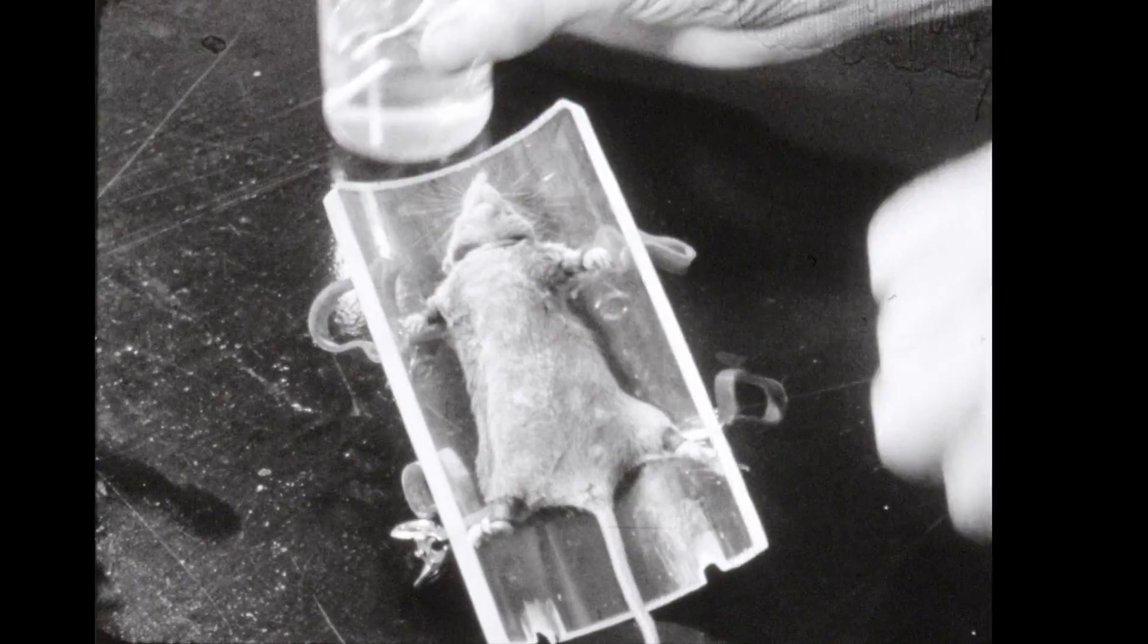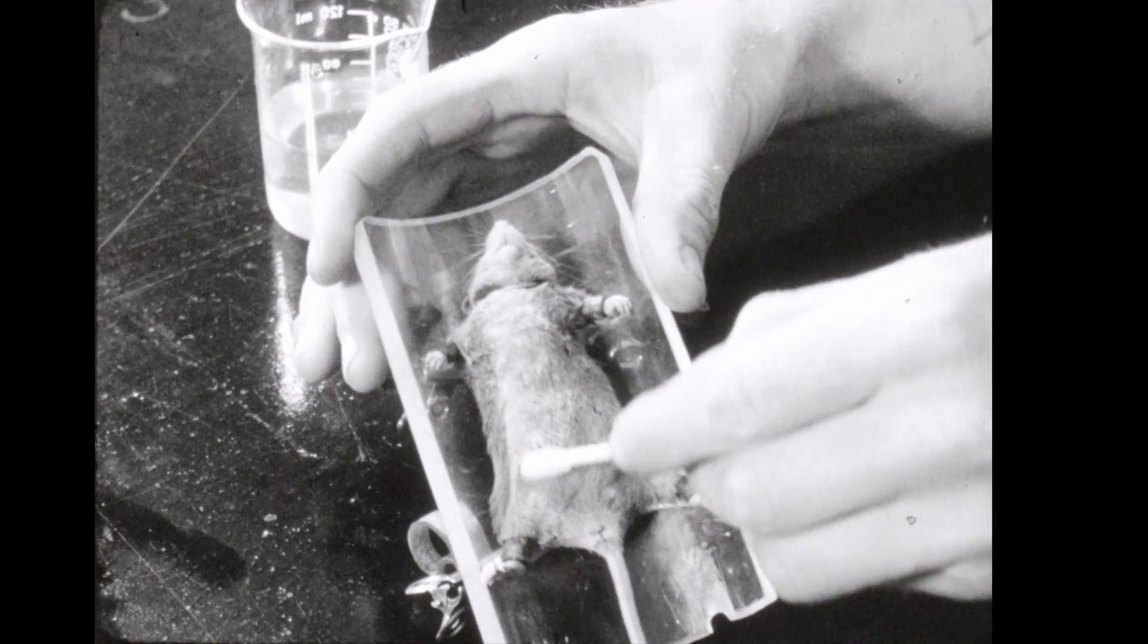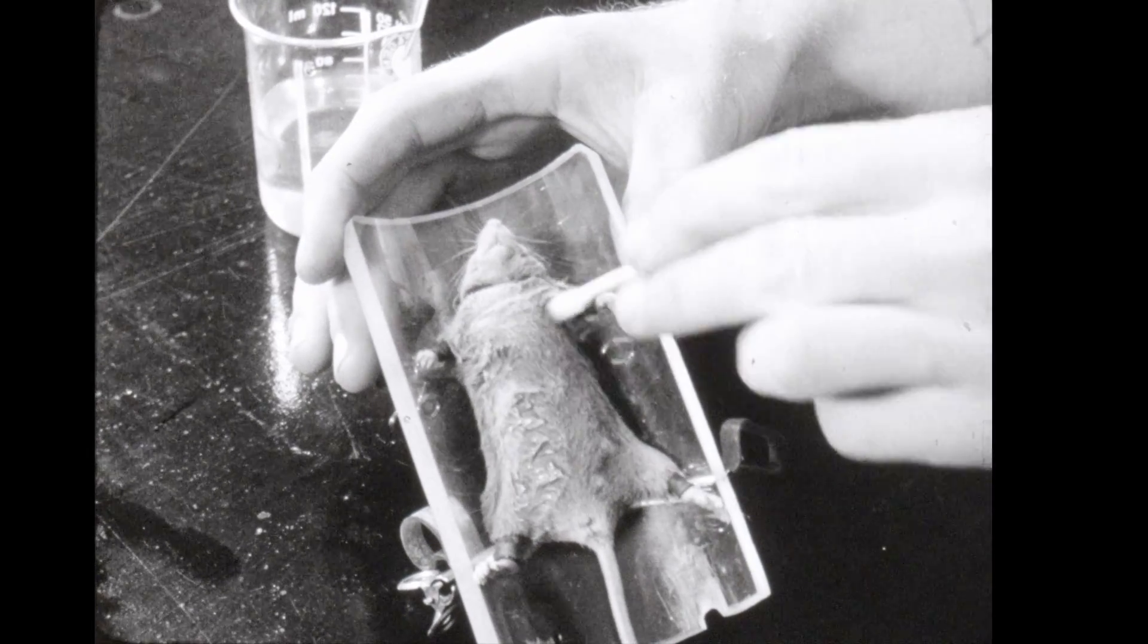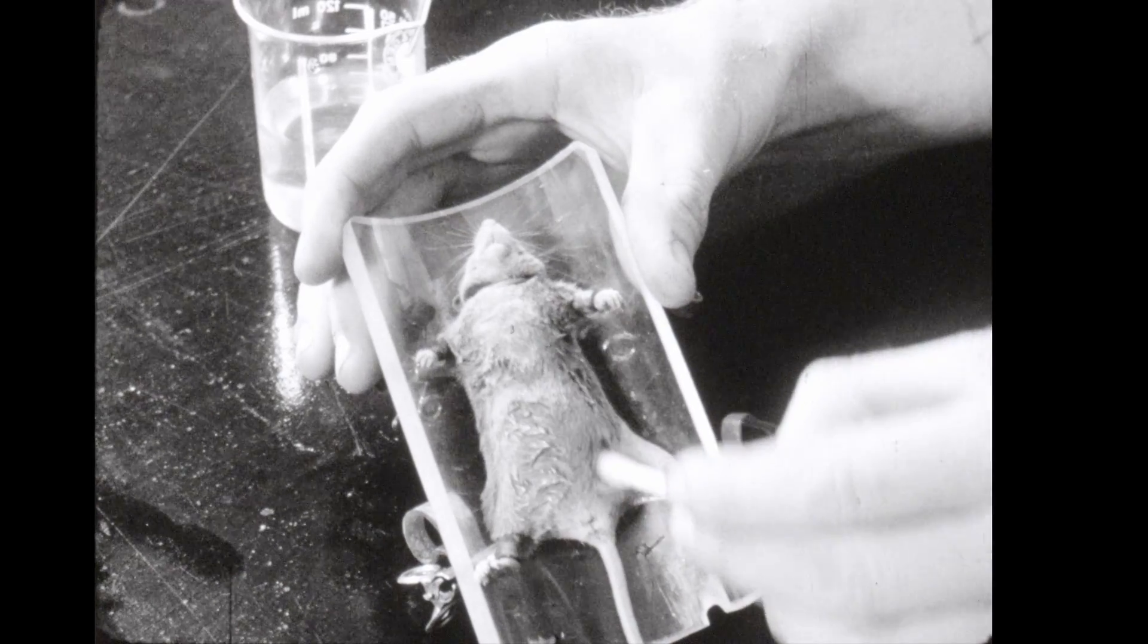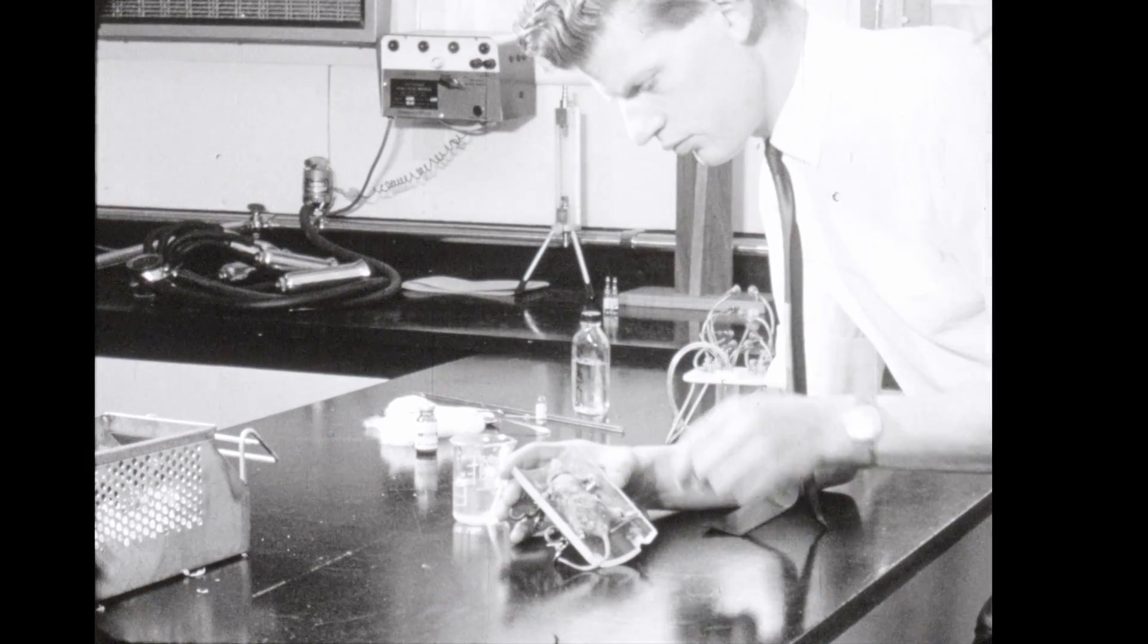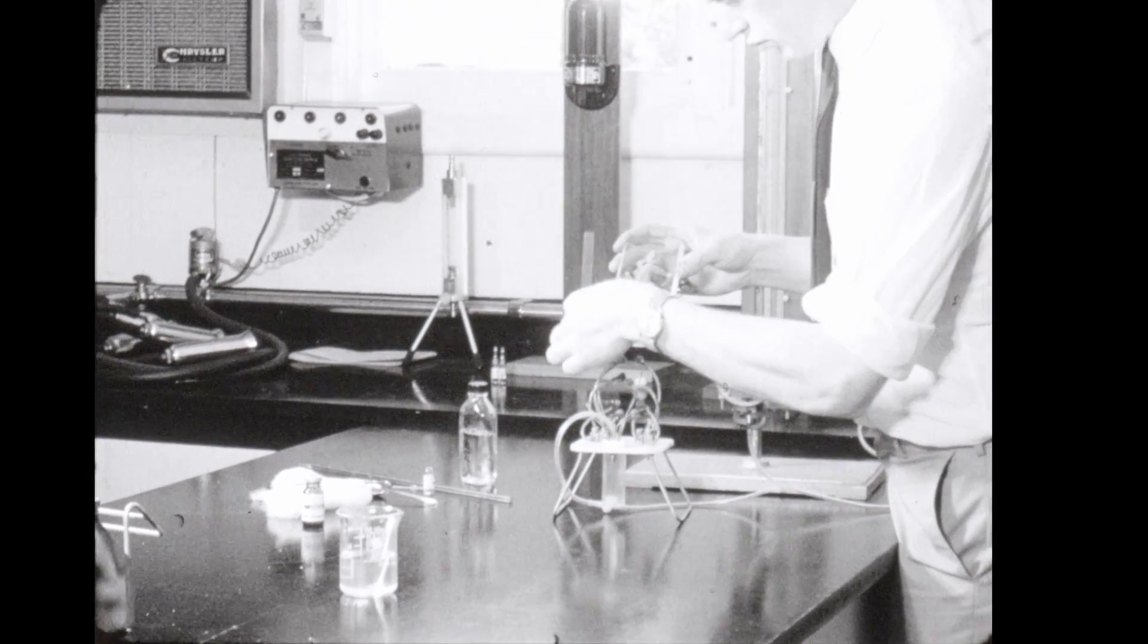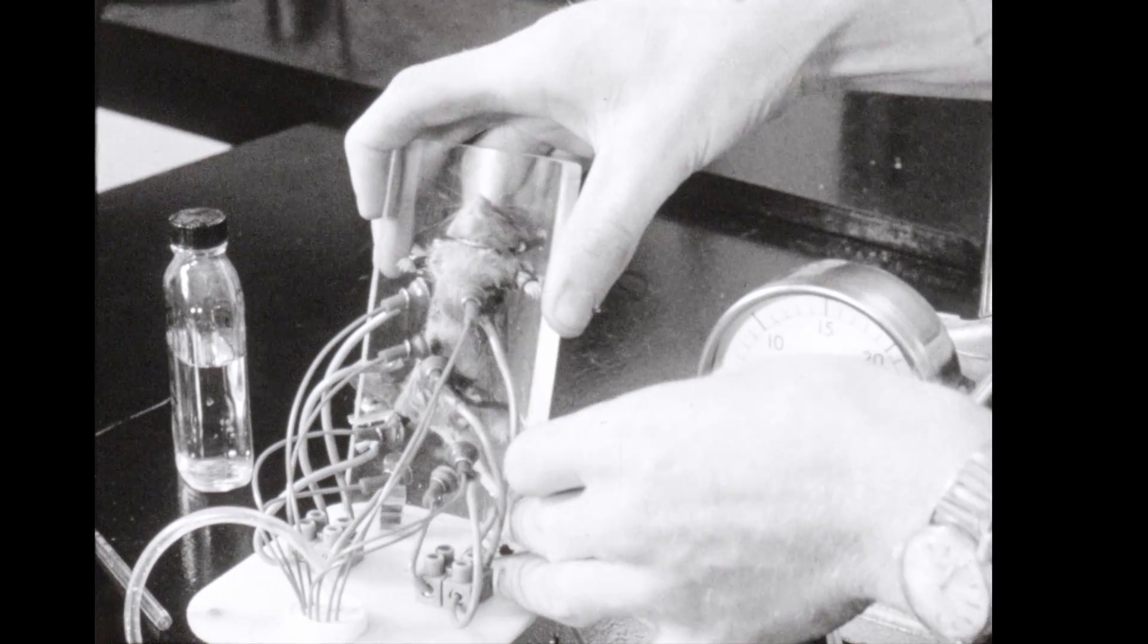The milk flow is stimulated when the ten nipples are rubbed with a swab stick containing sterile saline solution. The holder containing the mouse is then clipped vertically into the bale.